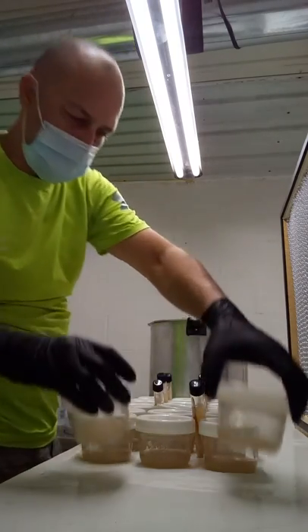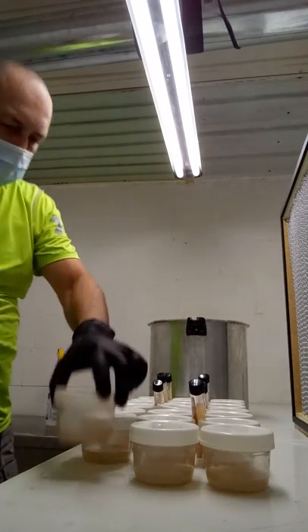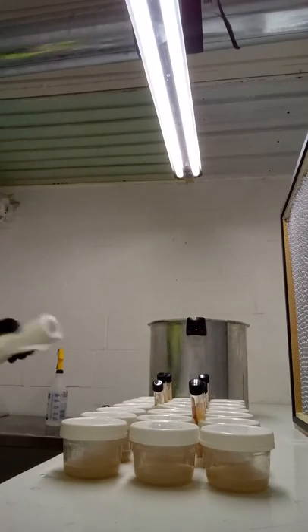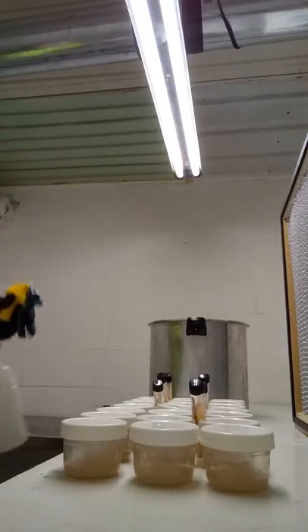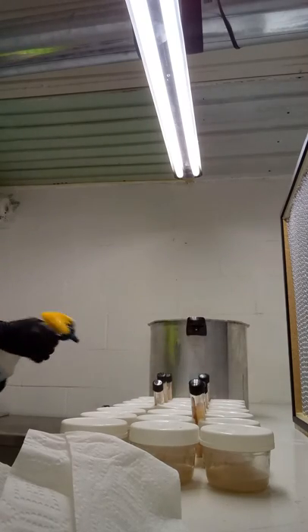I forgot to spray my hands down with isopropyl alcohol. That's all right — it's pretty sterile in here. The next thing I'm going to do is just spray them all down with isopropyl alcohol and wash the tops off.